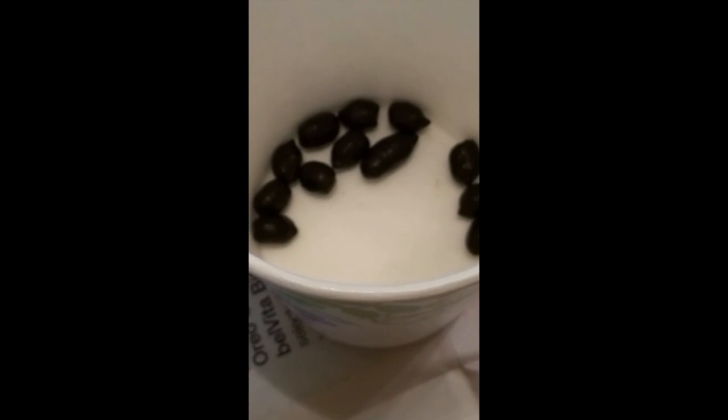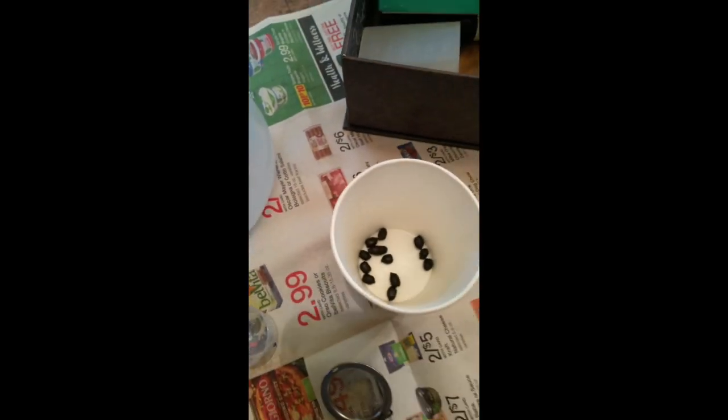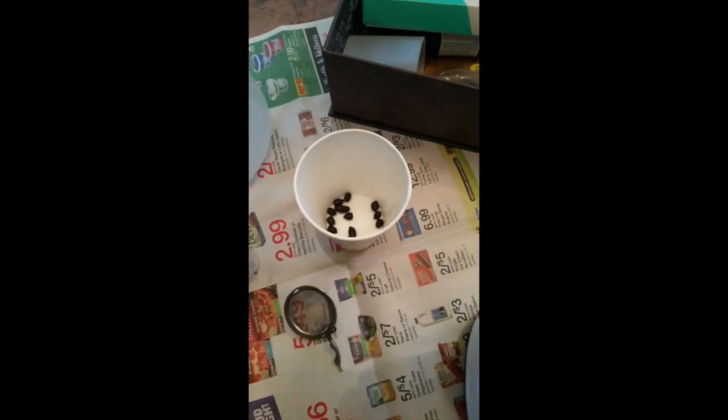Hi all! You might wonder what you're looking at - yes, of course, that's little goat berries. What we're doing today: even though these look pretty normal, let me shake them for you. They make a nice sound, just like a little baby's rattle.